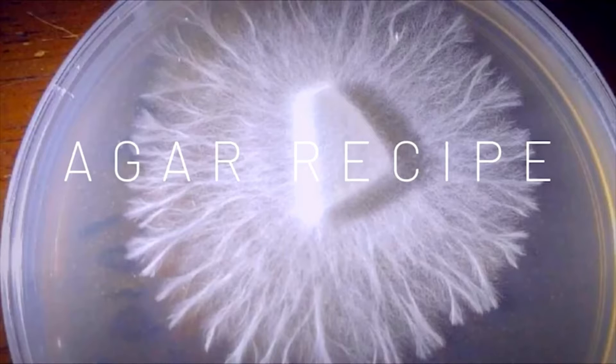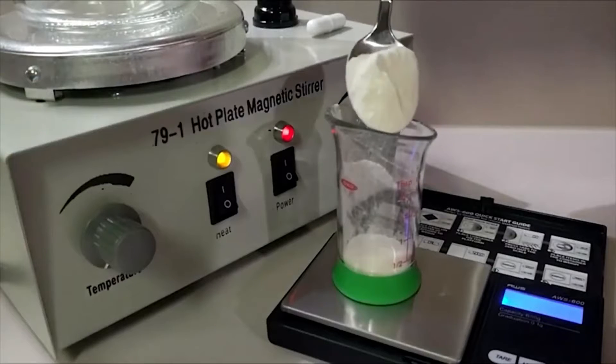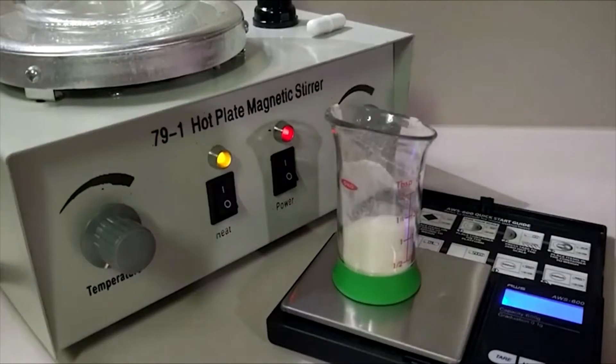As this process evolves, you will add nutrients to further encourage rhizomorphic growth so you can clearly tell where the best entry points for transfers are occurring.